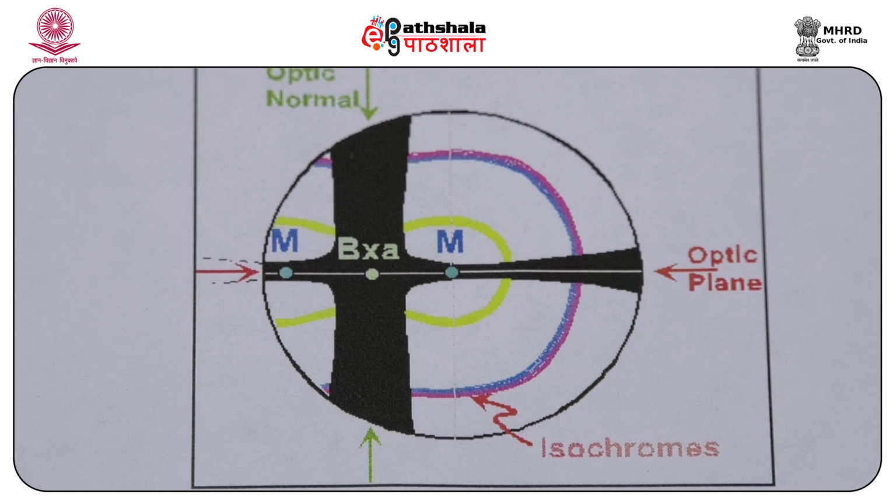As the microscope stage is rotated, it swings across the field, forming a hyperbola in the 45-degree position. What I have shown here in this diagram is actually a centered optic axis figure, where one optic axis is vertical and correspondingly the second optic axis and the acute bisectrix are inclined to the vertical.